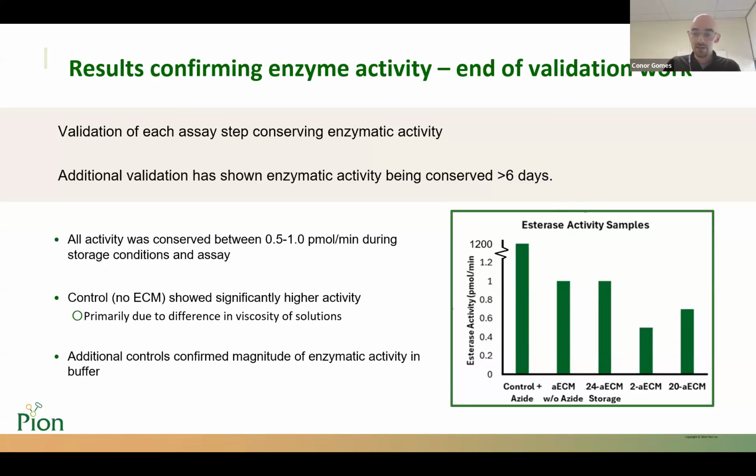So after validating that the esterase and these enzymes can stay active within our system, we looked to expand upon our learning set outside of methylparaben to see if we can actually emulate the kind of action that you're looking for in an in vitro test within a formulation pipeline.